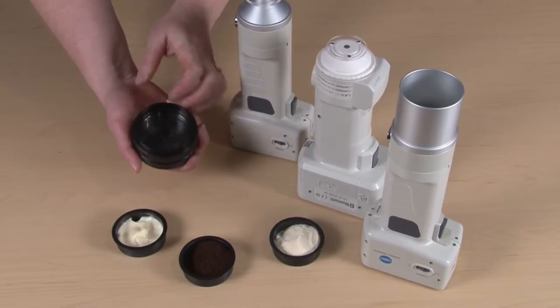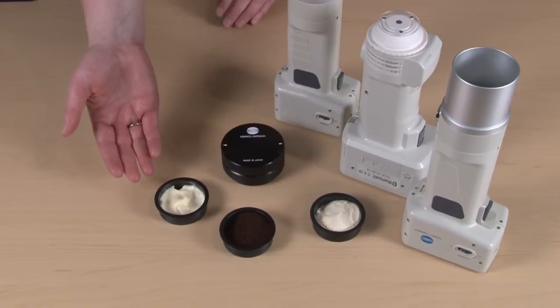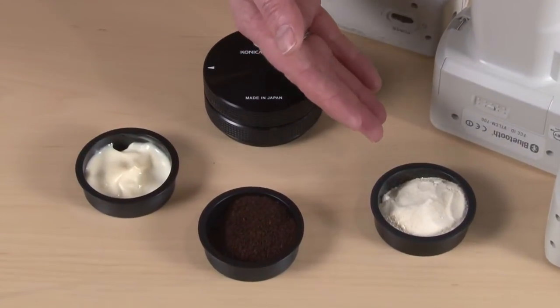This is a great tool to provide consistent sample presentation to the instrument. This will work with pastes such as mayonnaise, for example, also granulars such as coffee, and fine powders such as powdered milk.